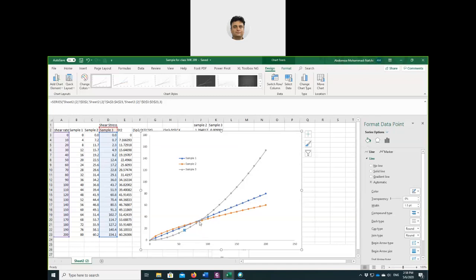And in different shear rates, you can see that at lower shear rate, the viscosity of shear thinning is higher than Newtonian. After that is the viscosity of, as we call this one, shear thickening. Here it's opposite: shear thickening is higher than Newtonian, and then shear thinning. It depends on which shear rate you want to measure. It will be like this one.